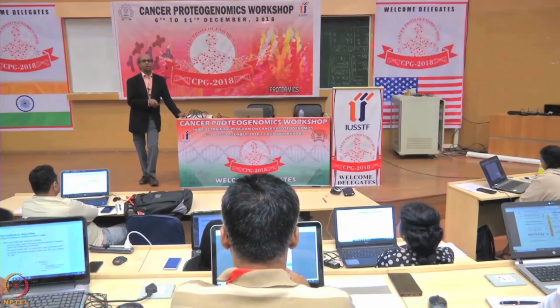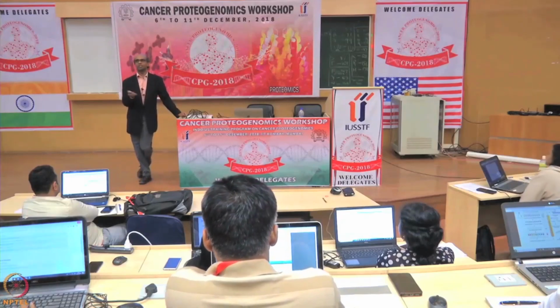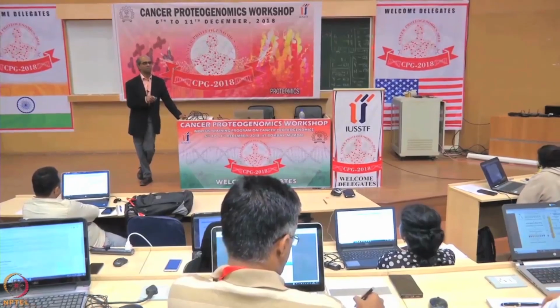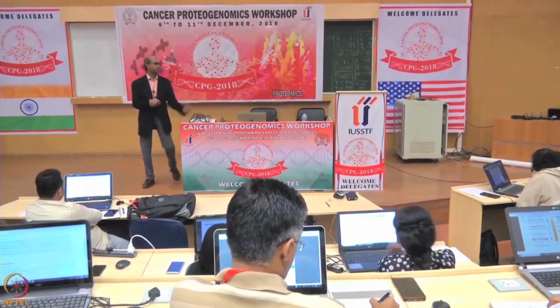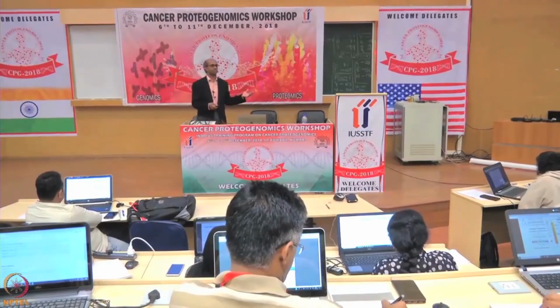If there is one thing you always want to try, median MAD would be a simple thing to do. Median MAD normalization, you can probably do it in Excel. You don't need any additional software. But for 2-component normalization, you will need some kind of statistical analysis package. We do it in R, but there are a lot of others that can implement the same process.